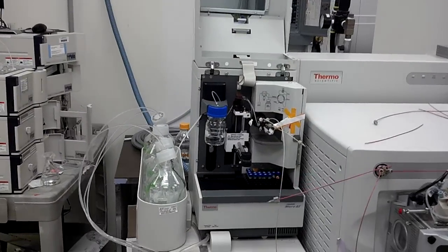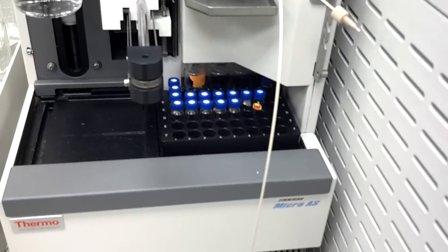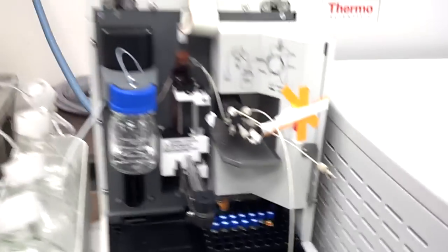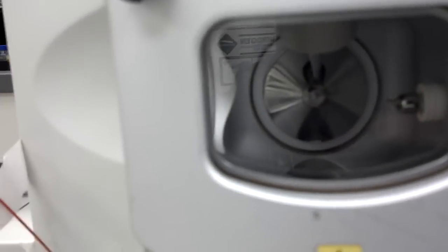This is an auto loader. Put your little samples in there and hit go, and it loads them for you. Shoots it in the machine. You can see in there, there's like a little needle that gets sucked in there, and those little particles are analyzed.